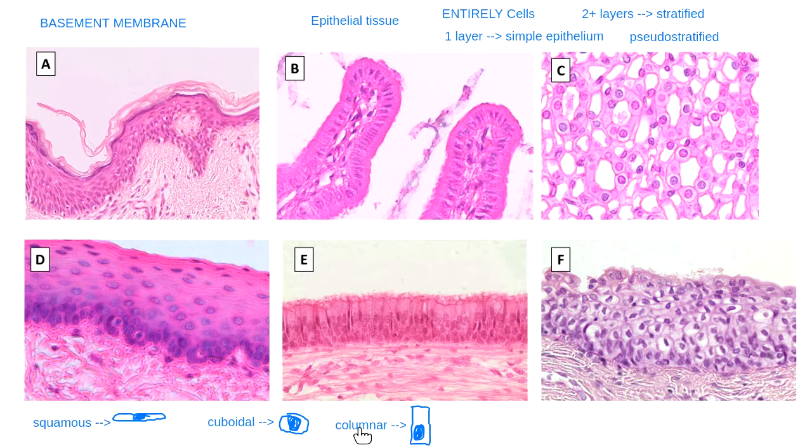Anytime you are looking at epithelial tissue, think in your mind about the number of layers that you see and the shape of those layers. Before you get into all the specifics where you start trying to figure out exactly which type of tissue it is, try to make some predictions in easy person words, I call it, about things like the shape of the cells or the number of layers. If we can make those kinds of predictions, that's going to help us to match things up with their names. So let's start, since I'm pointing to it right now, with examples of columnar epithelium.